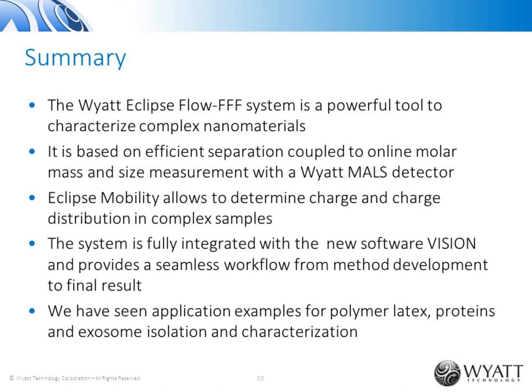First question I have here is, can you elaborate on how you calculated the net charge of latex and proteins?